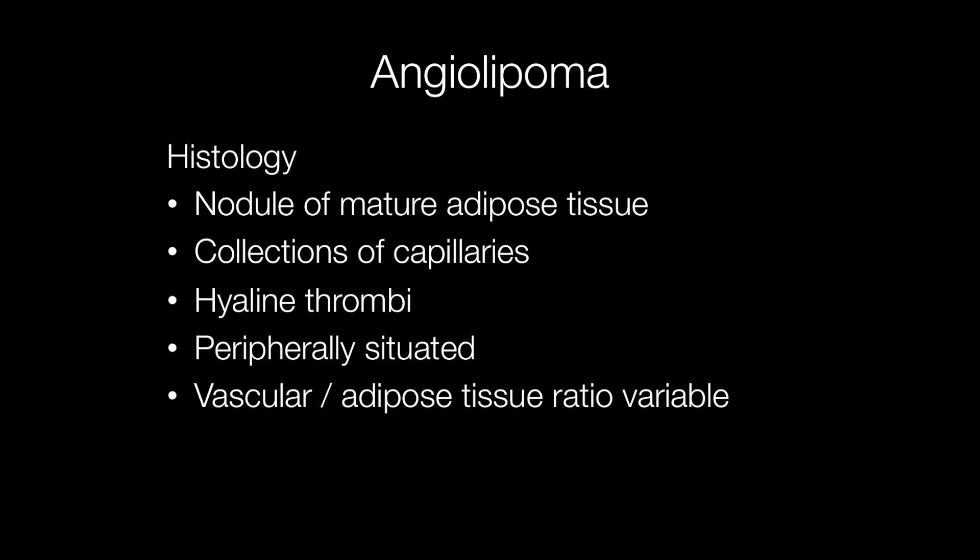Histologically, angiolipomas are composed of nodules of mature adipose tissue containing collections of capillaries that are usually situated at the periphery of the lesion.